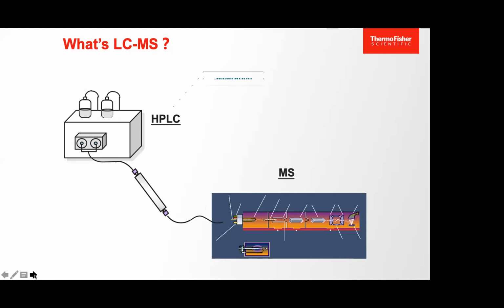So it will have a separation, detection. Then on the mass spec side, from here until the column, it will still be in molecule form, in liquid. The mass spec doesn't detect neutral compounds. It will only detect cations or anions. So this is when you need to ionize. There will be an ionization process, and it will ionize and be detected by the mass spec. We will go through each of them later.